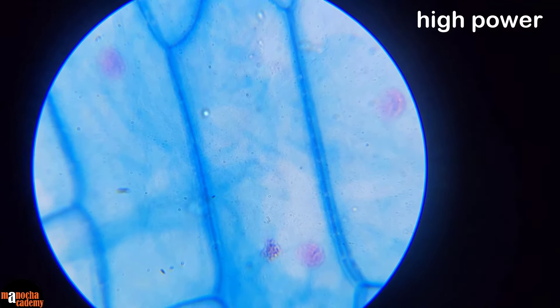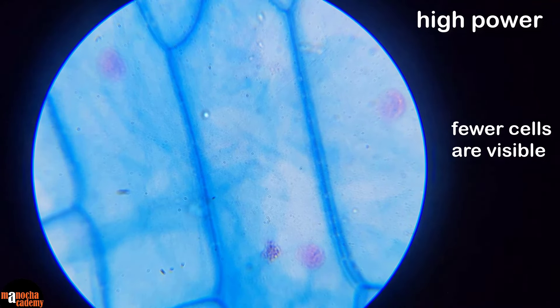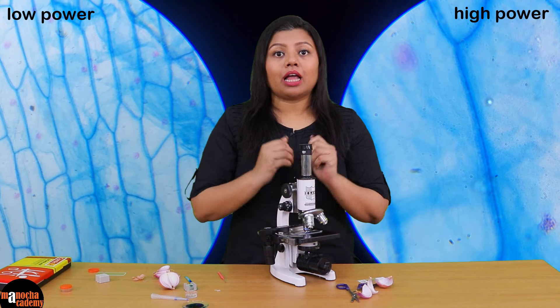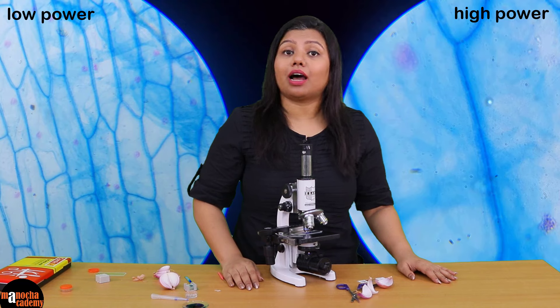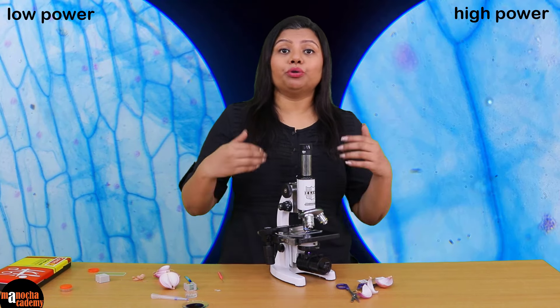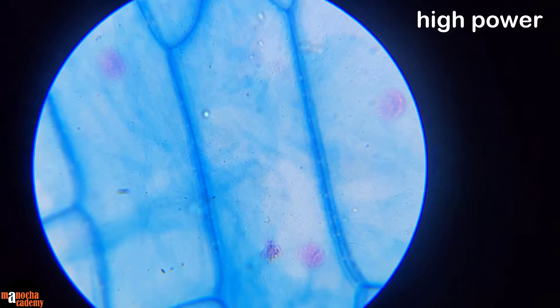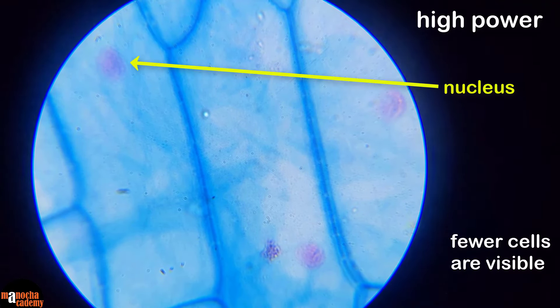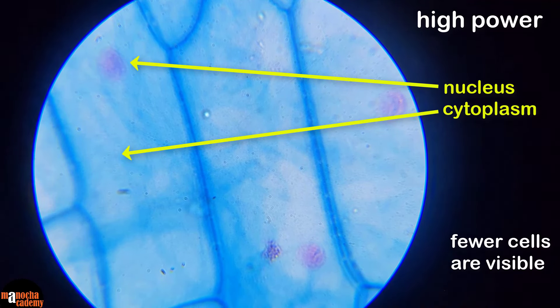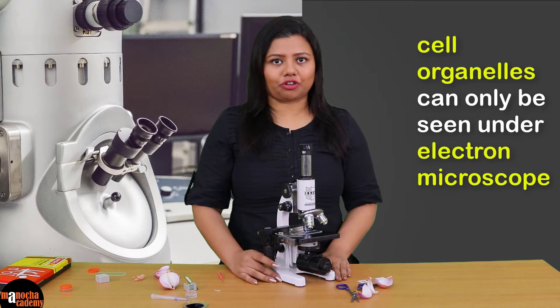Let us now bring this under high power. Under high power you see fewer cells. Why? Because in low power you see a large area of the tissue and therefore a larger number of cells, but the moment you use higher magnification you see a smaller area of the specimen — so although the image is magnified, you see fewer cells. The nucleus is prominent here and so is the cytoplasm. We cannot see cell organelles because for that we need a much higher magnification, which is possible with the help of an electron microscope.